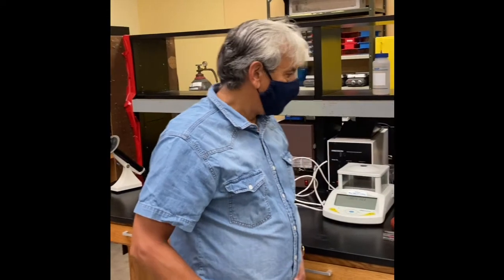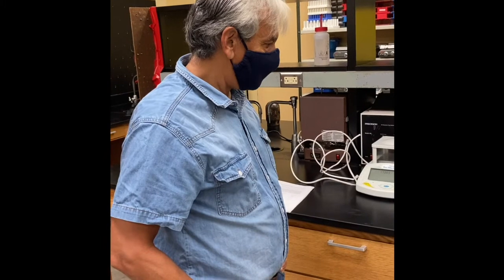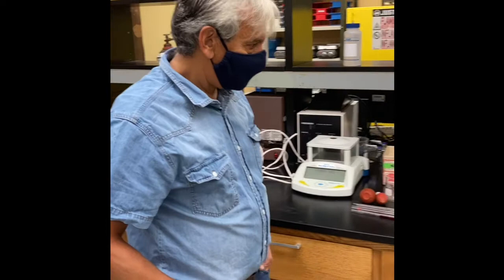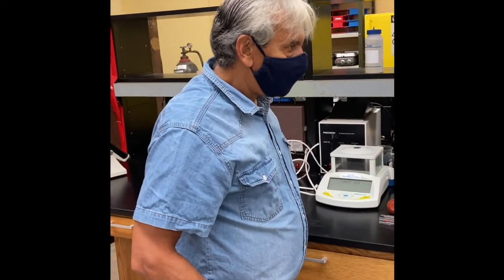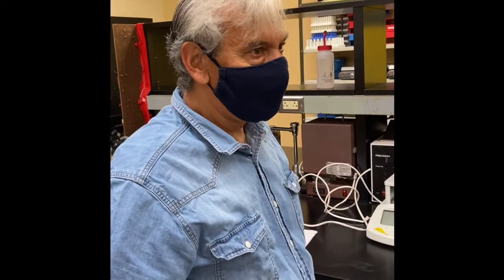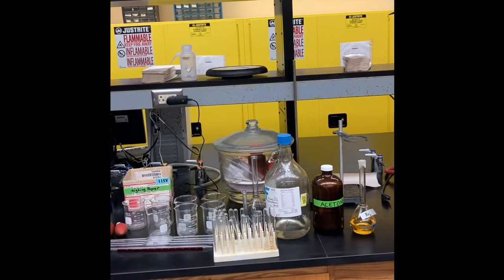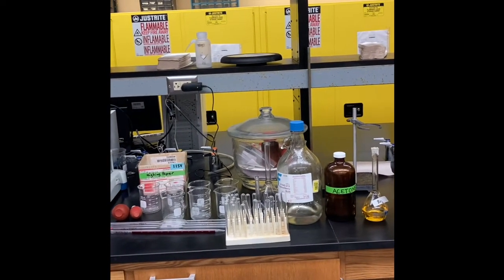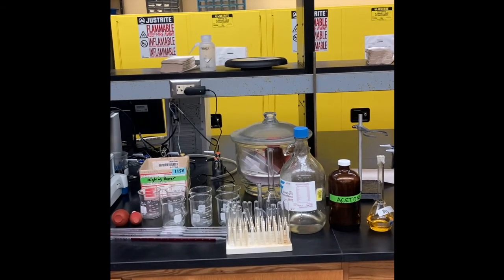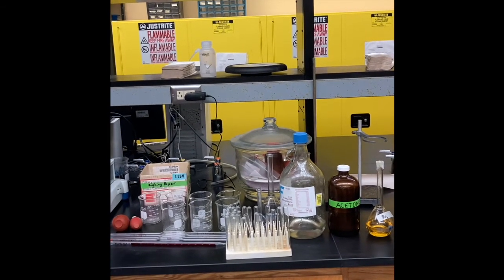Hello students. Today we will talk about the experiment on kinetics of bromination of acetone. This experiment uses the method of initial rates to measure rates of the chemical reaction of bromination of acetone catalyzed by hydrogen ions in the form of hydrochloric acid, and these measurements are made with different concentrations of different reagents such as acetone, bromine, and catalyst, which is hydrochloric acid.